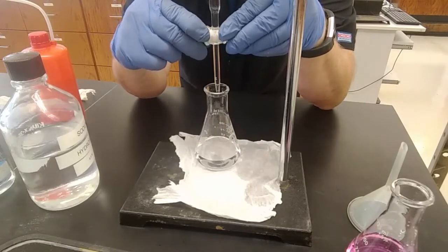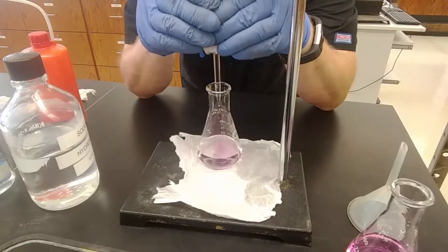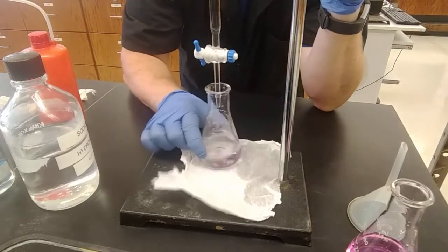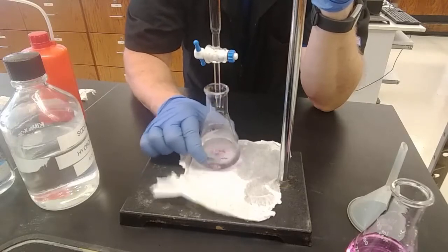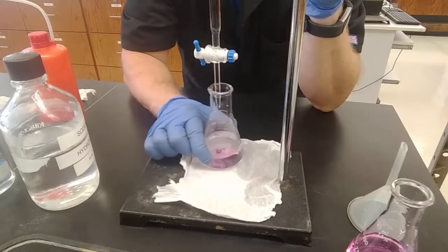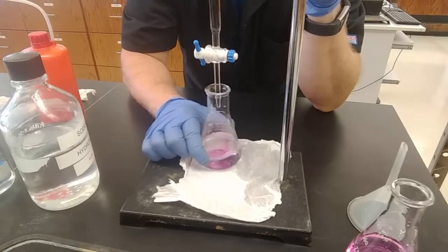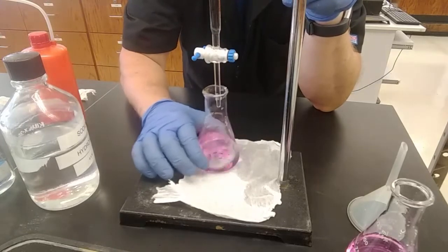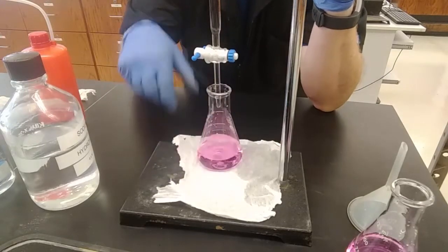So I'll get it going a drop at a time, a little slower than that. Lower it down in so the tip is in there for sure. It's turning pink, but it's going away. It's turning pink, but it's going away. I am not going too far. I want one drop to turn it pink, and that's it. Oh, did I stop it exactly right? I think I might have.